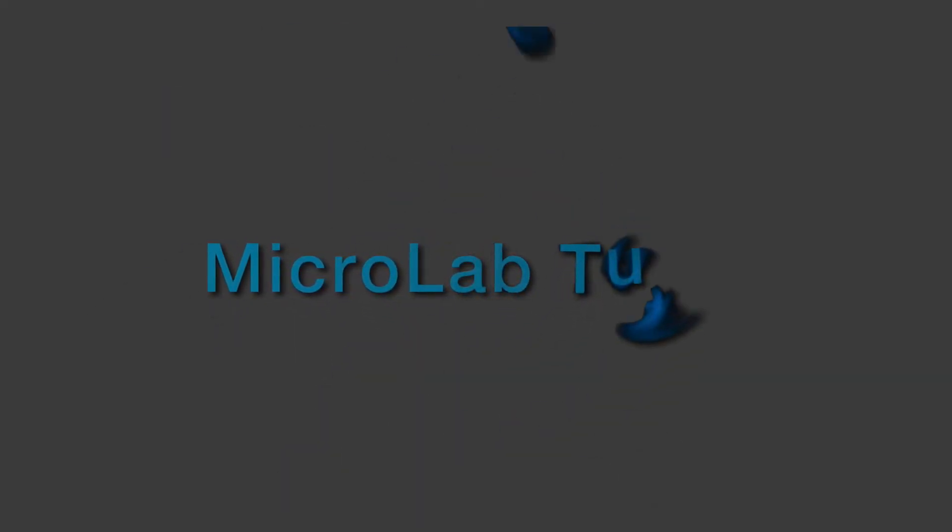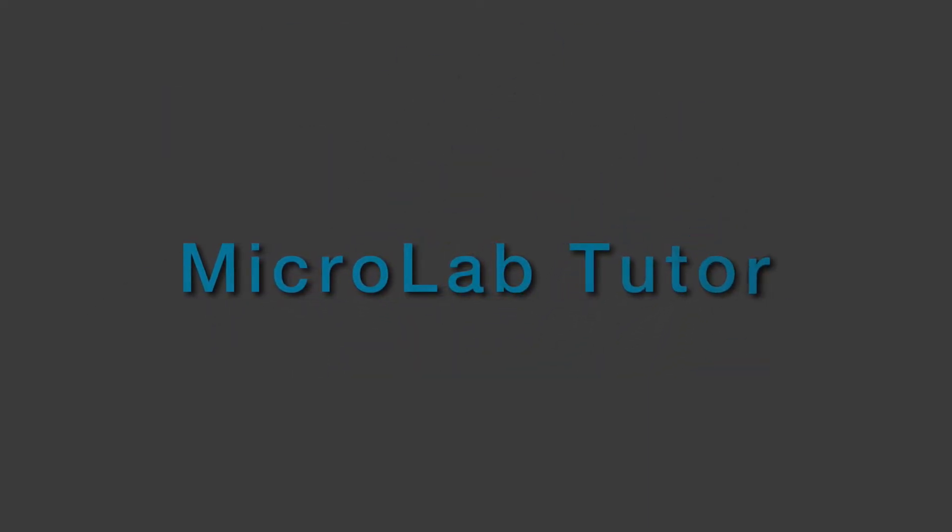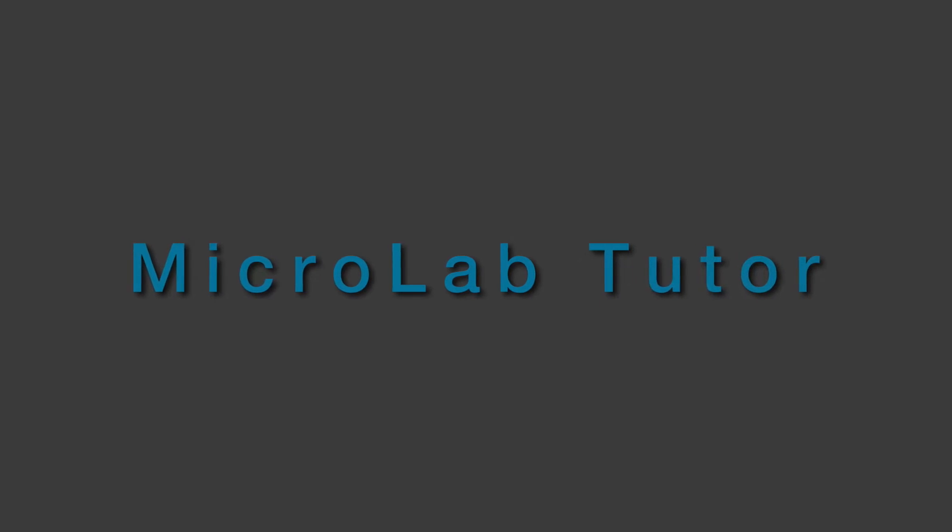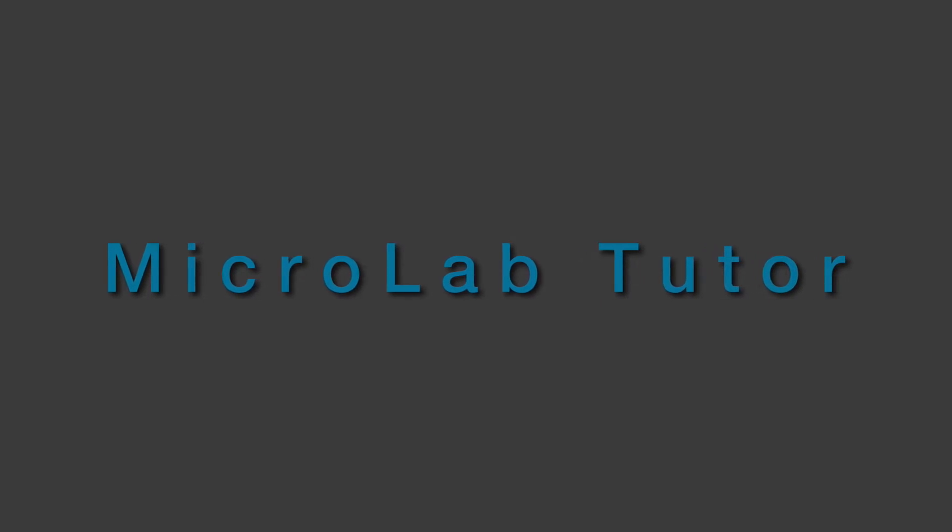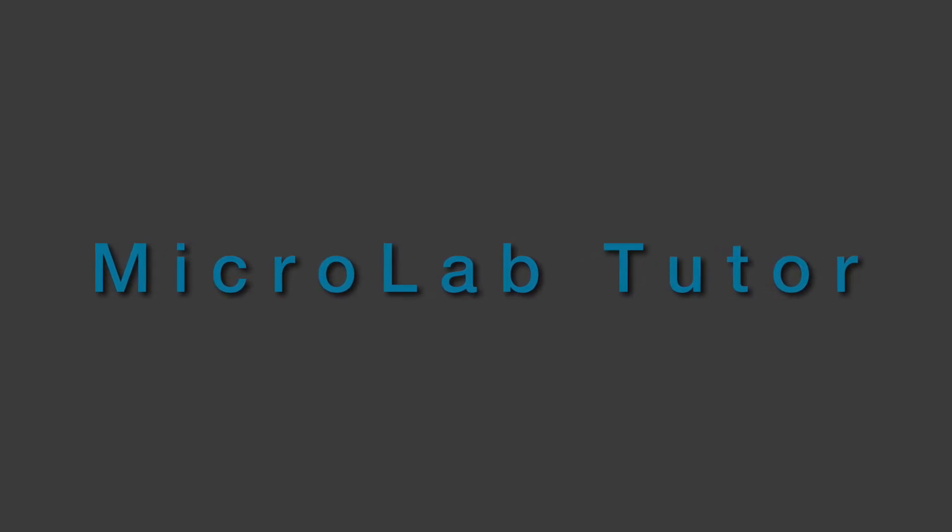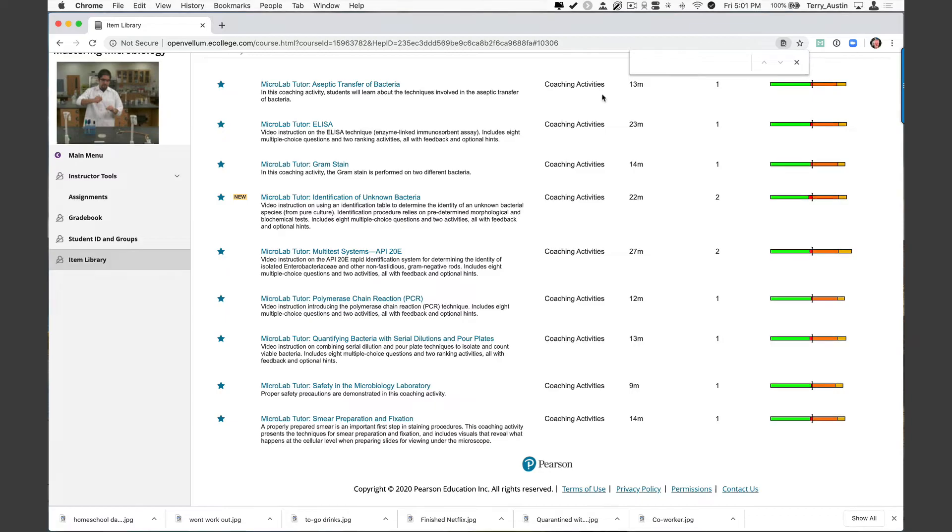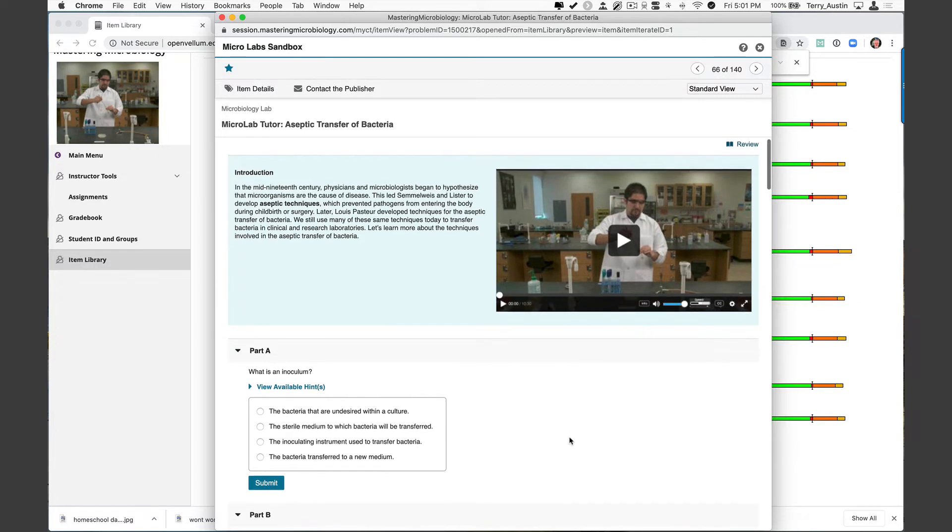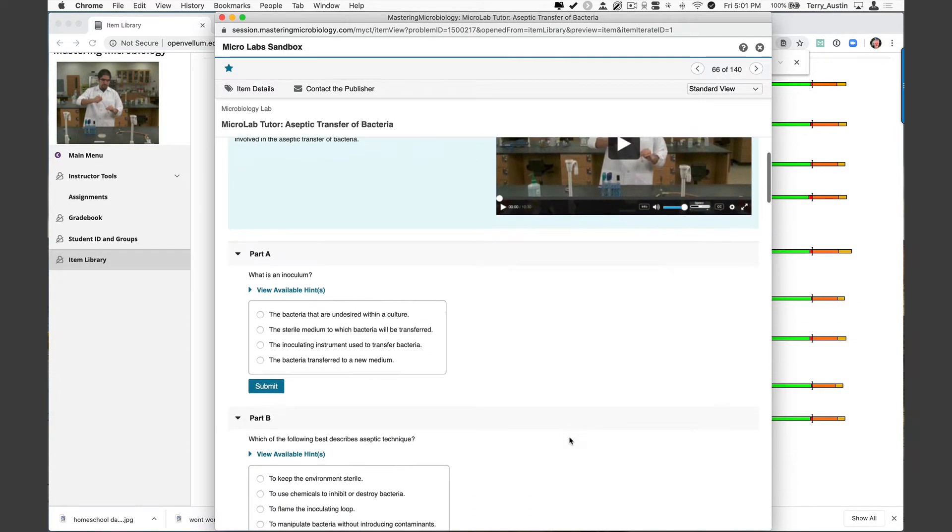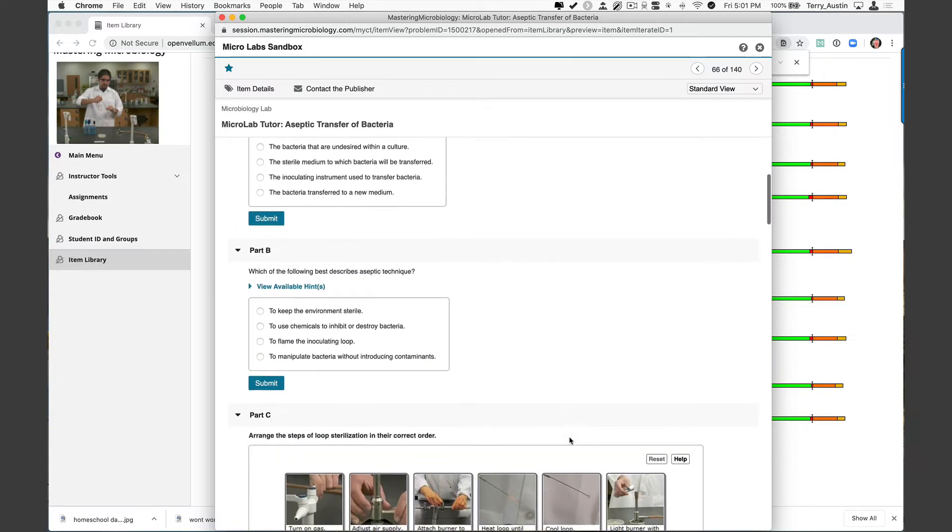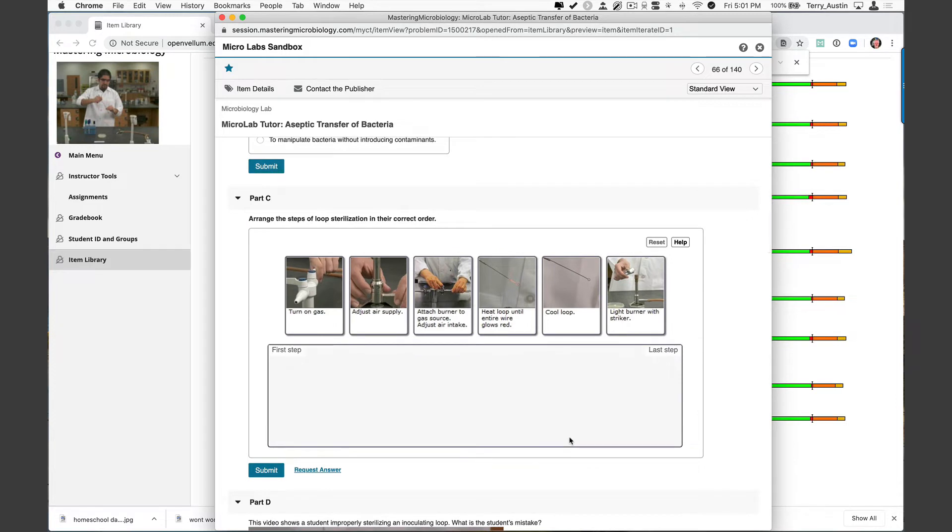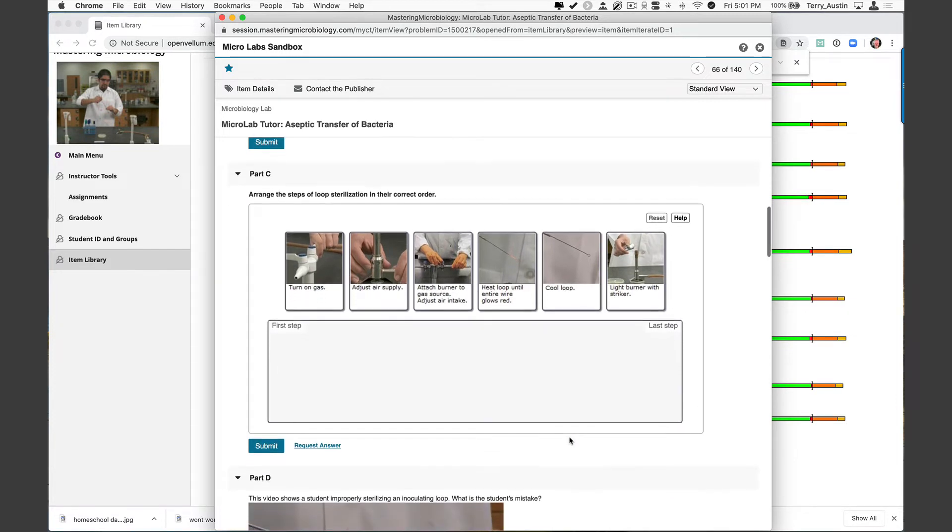Now let me take you back to probably my very favorite of the lab tools available: micro lab tutors. And I'm going to start with the one that I've loved for a long time, aseptic transfer of bacteria. Let's open this. Now you're likely getting used to this format. We've got a training video at the top followed by questions. But what I really like about this is we actually have some very interactive questions along the way.